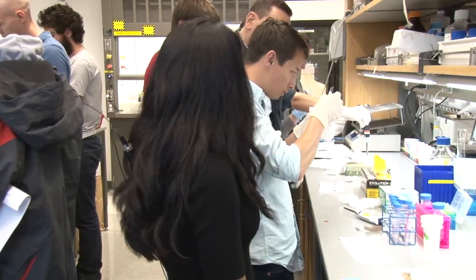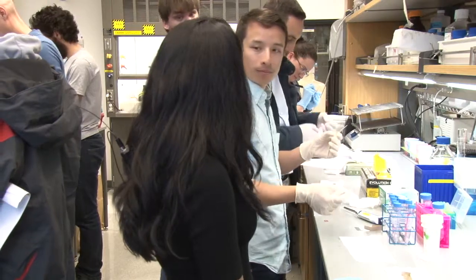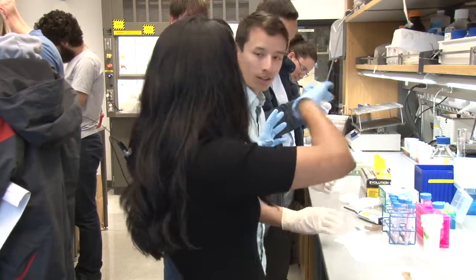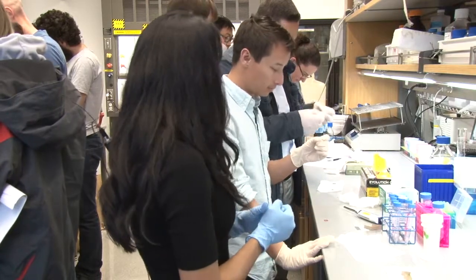Drying and bubbles are two things you need to take care of. You don't want your slide to dry — you might start seeing H-probes being deposited in random places, and you don't want that.